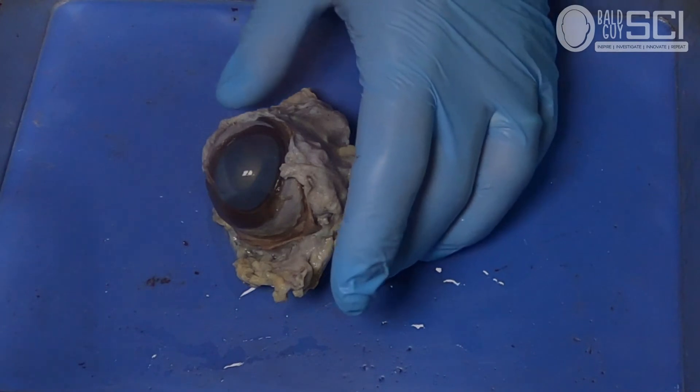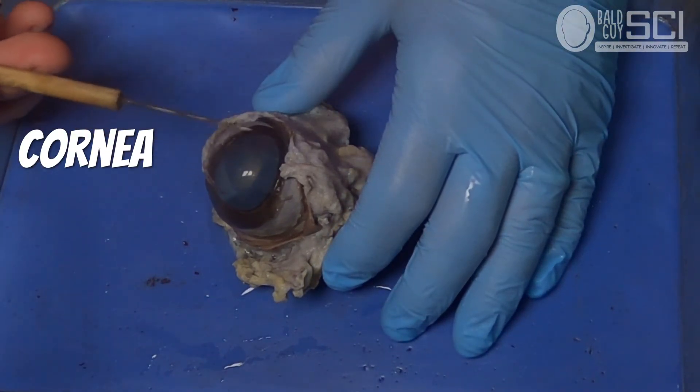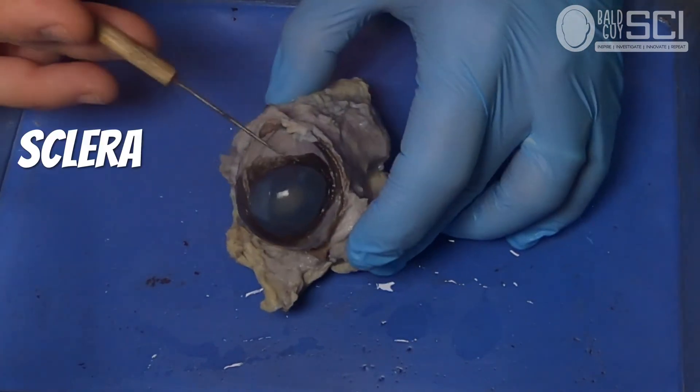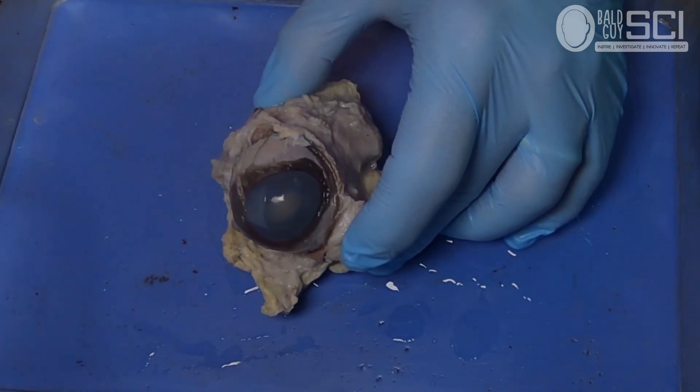There are five things you need to find on the outside of the eye. The first one is the cornea. The cornea is a clear dome-shaped lens of sorts that does the focusing of light — the first maybe 80%. Next to it is the sclera, which is the white part of the eye, and it's a tough connective tissue layer that protects the eye.